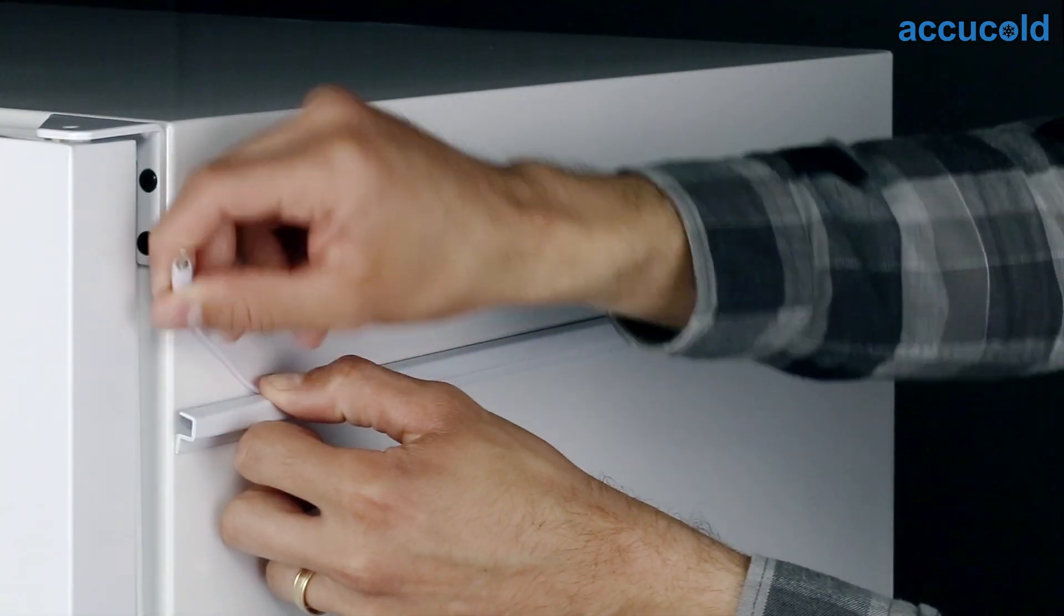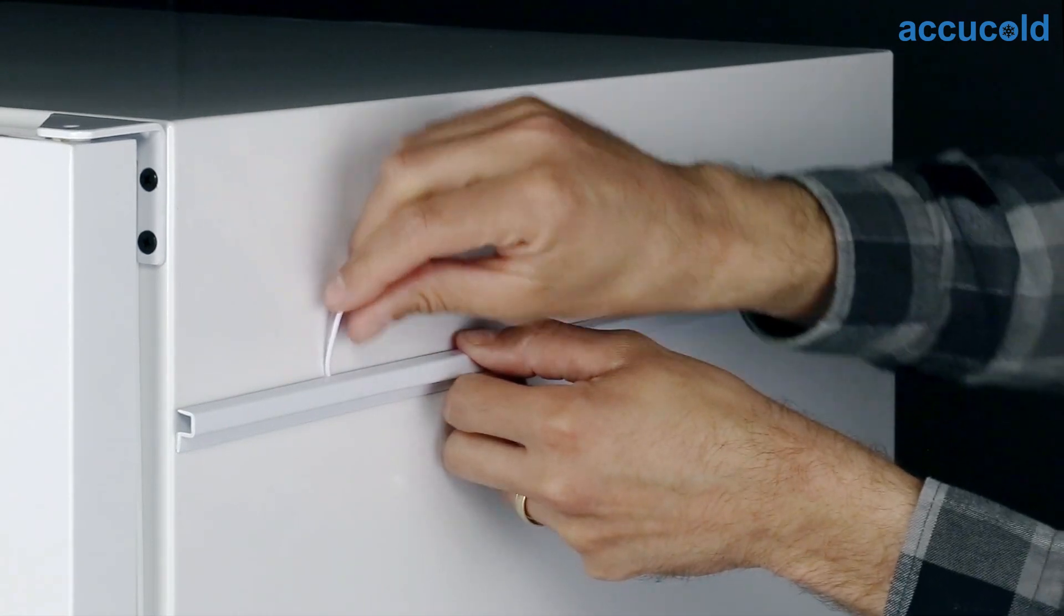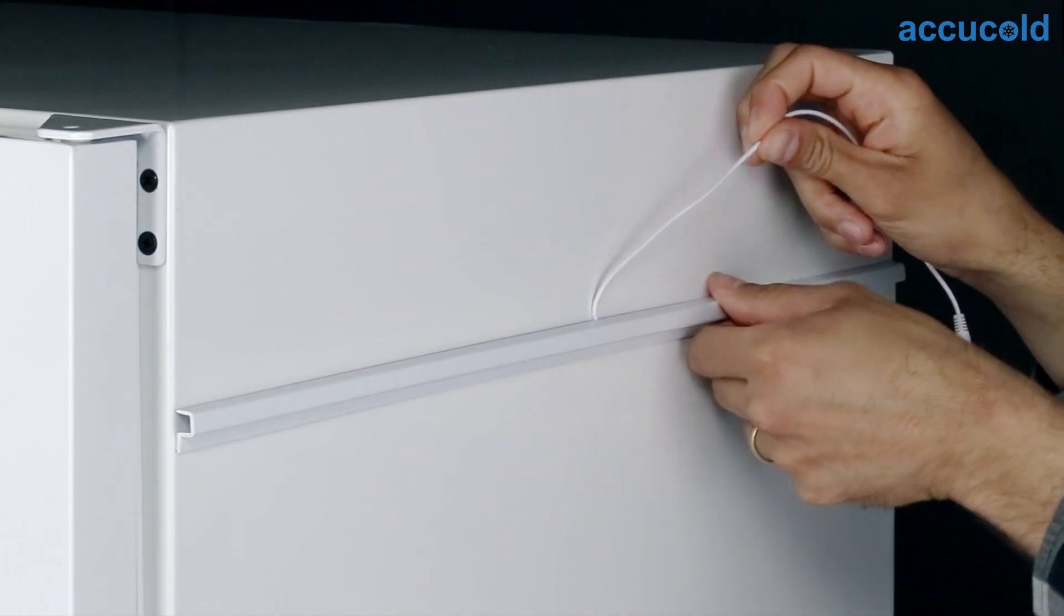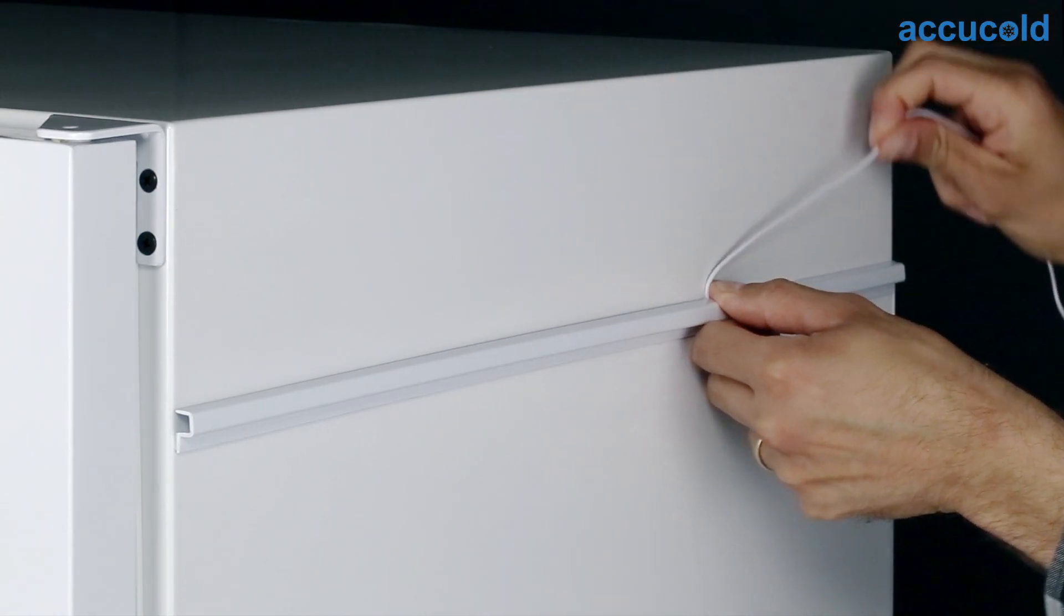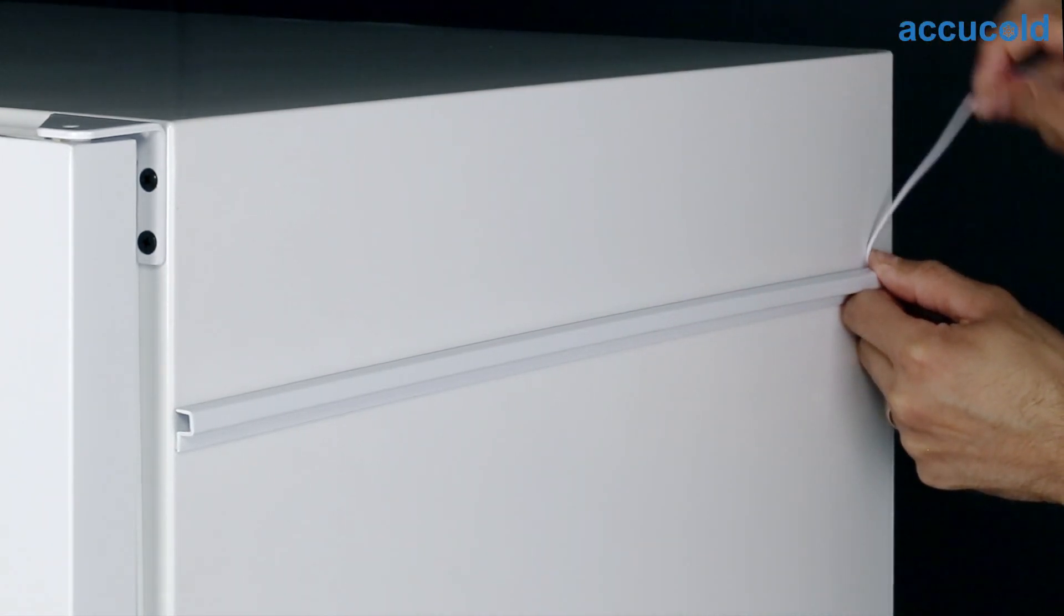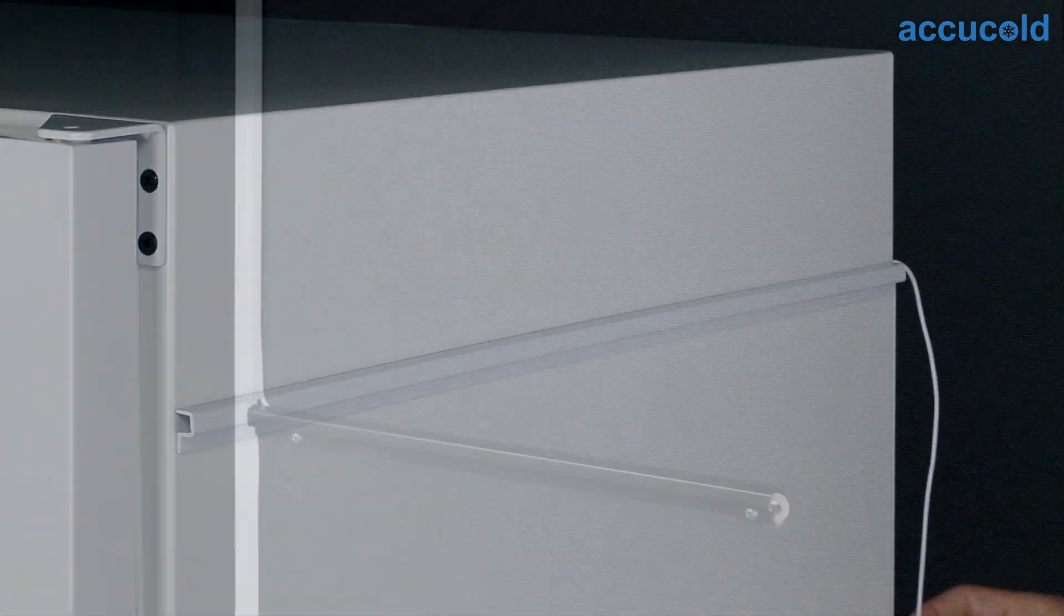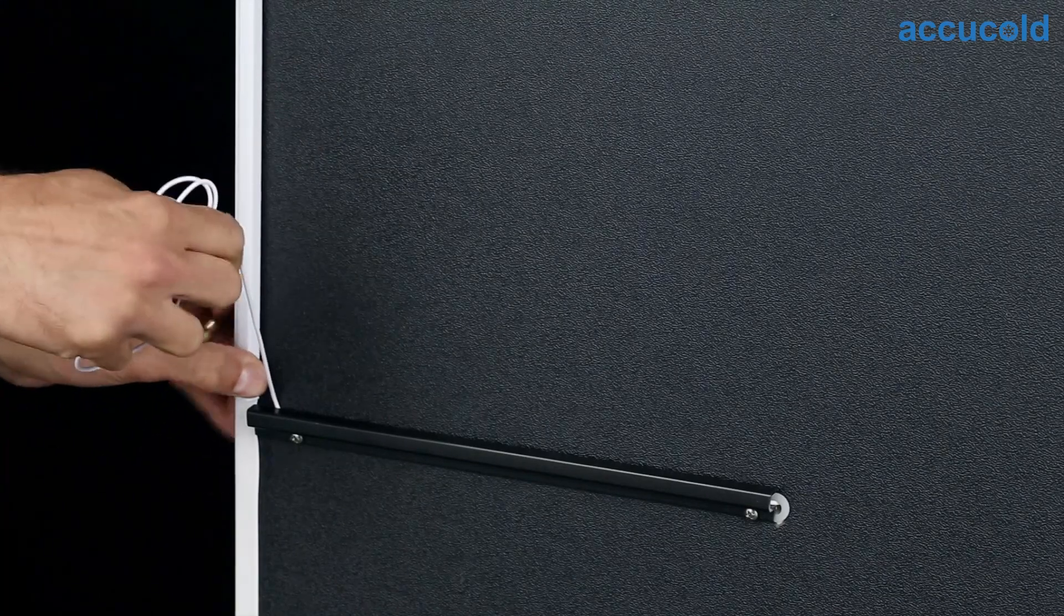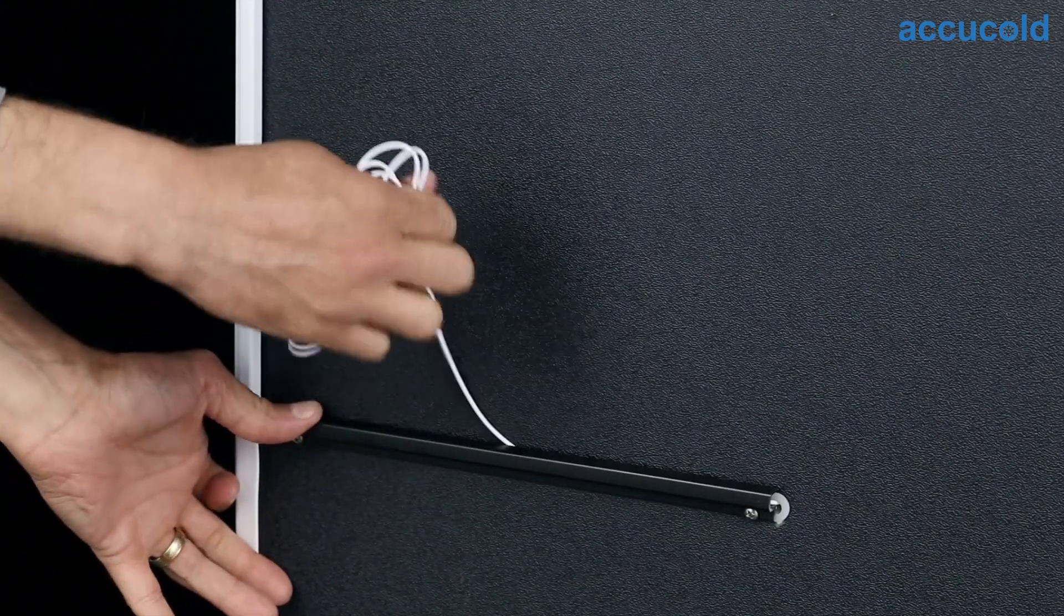If the wire runs through a channel on the side of your appliance, start at the front of the unit, pull the top of the channel away from the side, and lift the wire out of the channel. Proceed towards the back of the appliance until the wire has been removed. Repeat these steps for any channels on the back of your appliance until you reach the probe hole.